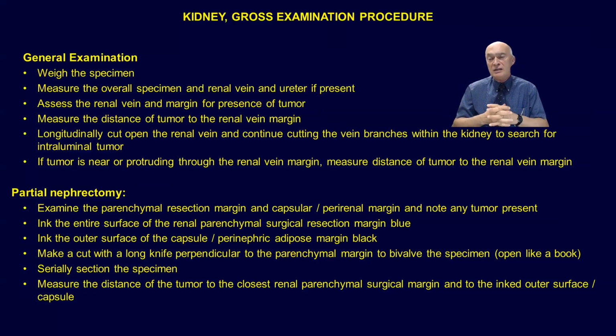Many of the cases of kidney radical nephrectomies come with a good piece of ureter, and the ureter is considered a different organ. So even for the purposes of charging CPT codes, the ureter should be treated as a completely different entity. If we are talking about a nephrectomy with a good portion of ureter, more than 5 centimeters, I will use a round length to consider that it's a partial or a complete ureterectomy.